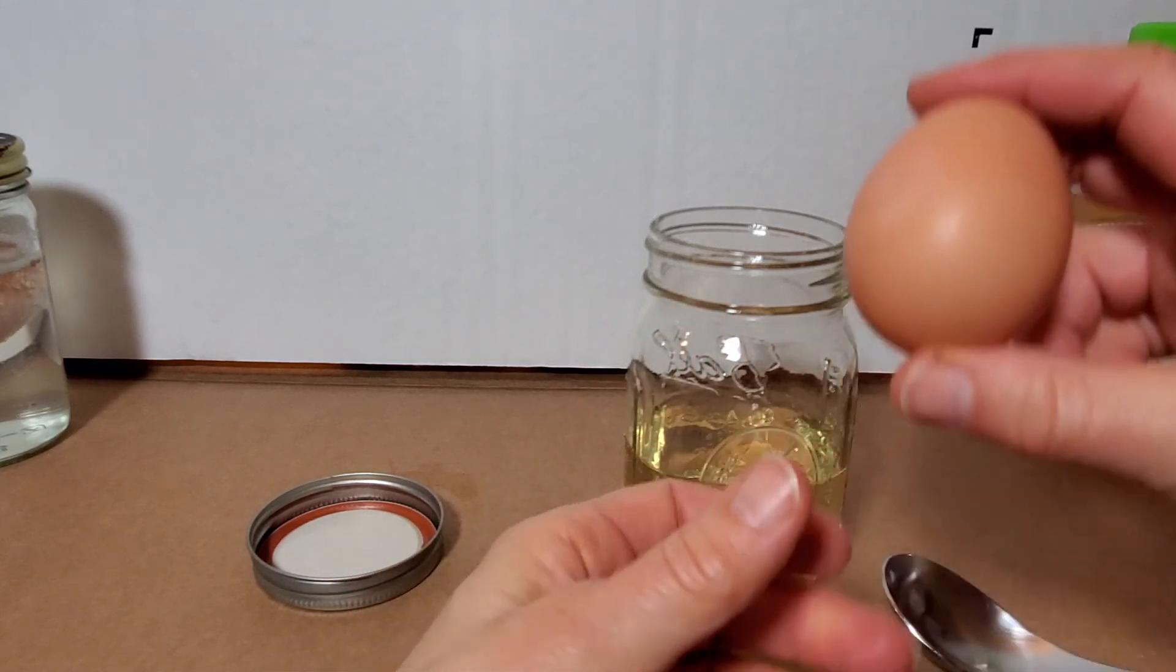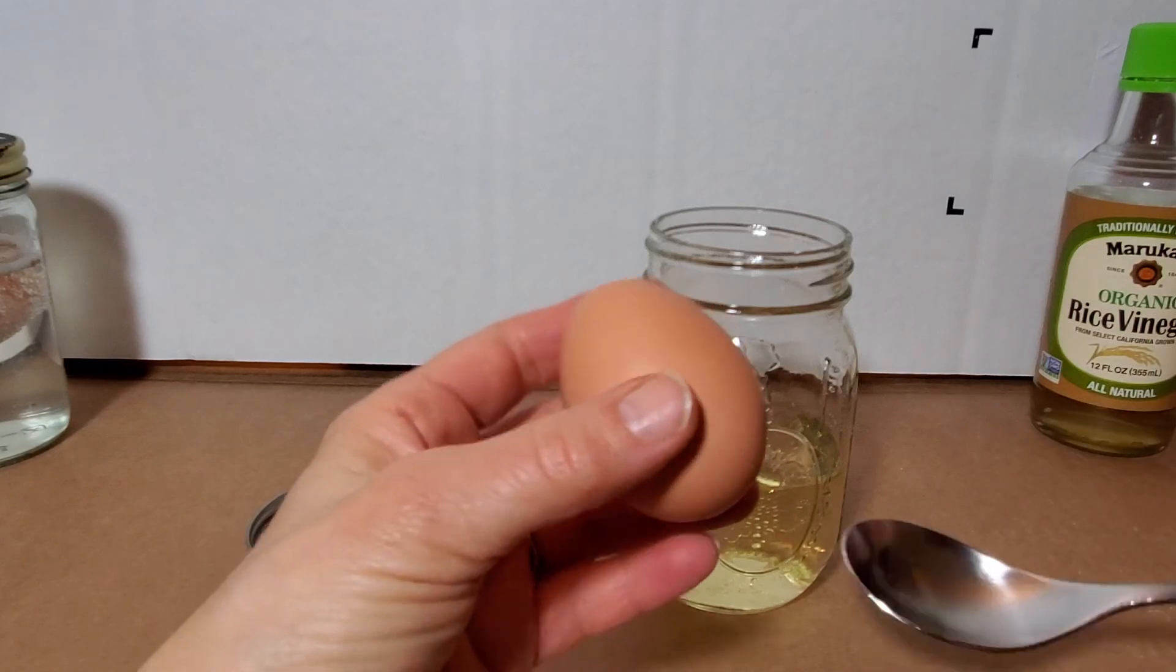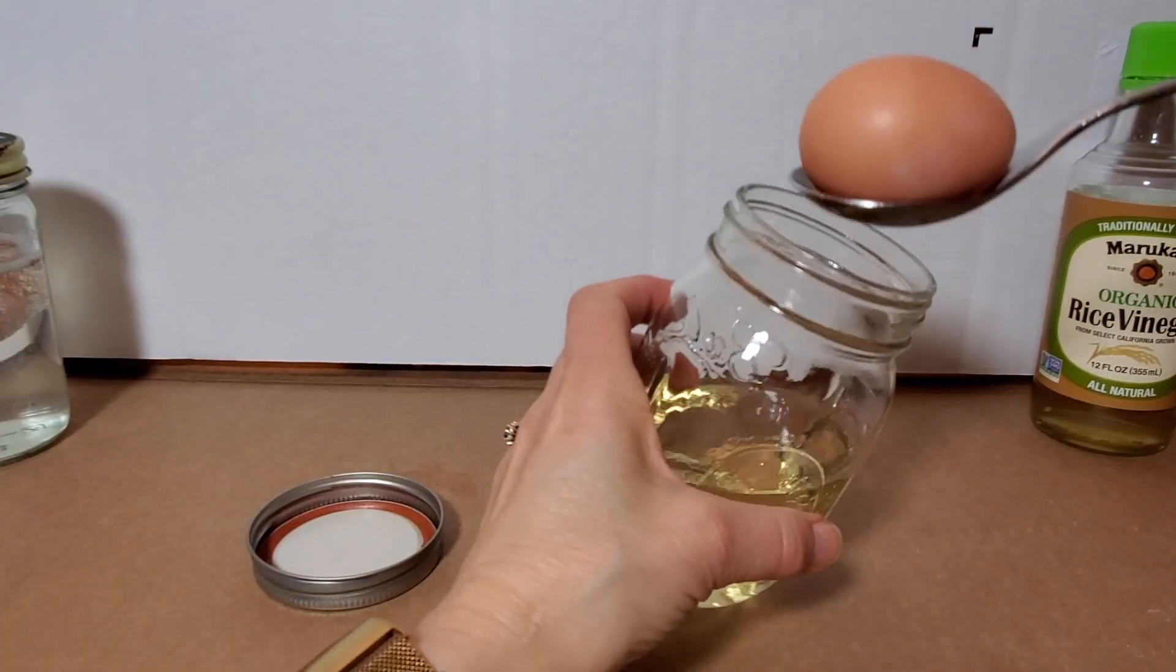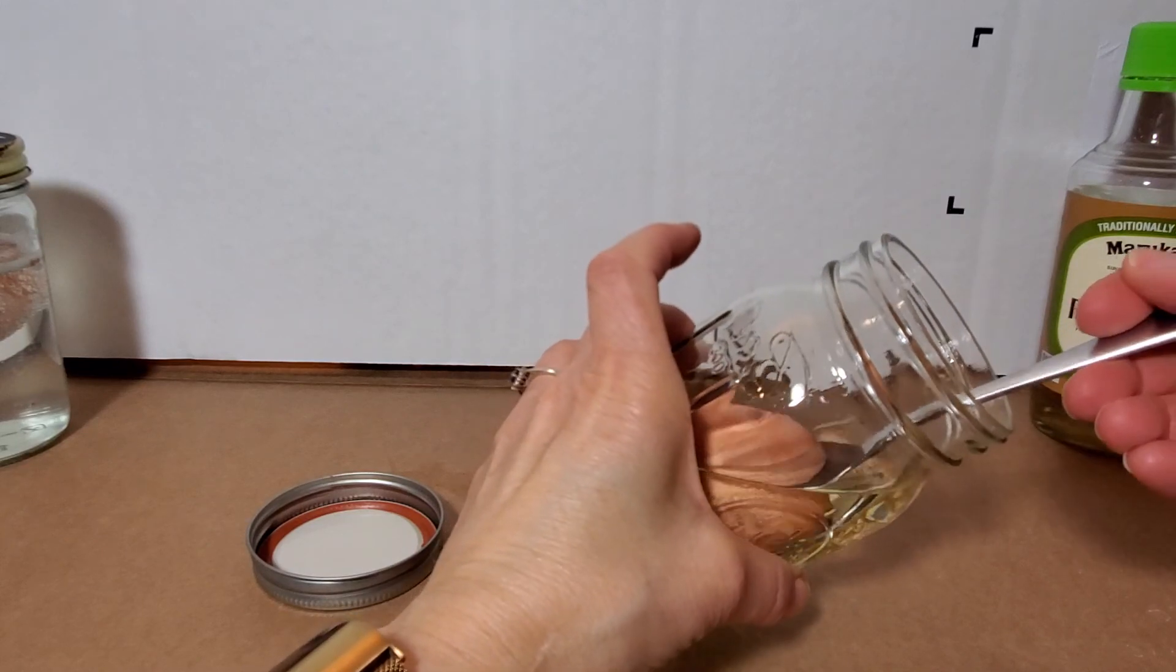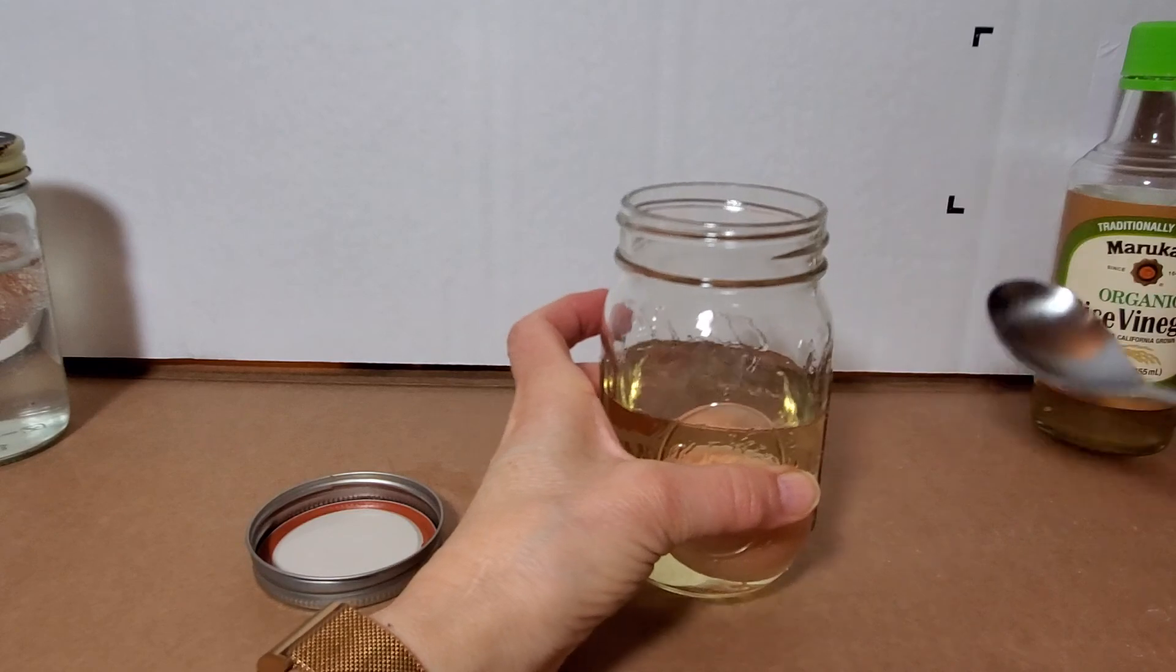So it makes a great macroscopic model of a cell that we can use to model some of the processes that would be hard for us to see otherwise. So I'm going to use a spoon to drop it in carefully so that I don't crack my egg when I drop it, and that's it.